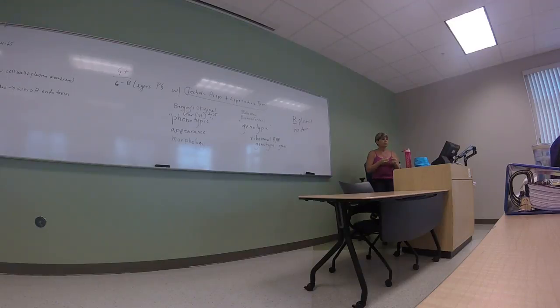Differential agar means when a certain type is present, you'll recognize it by a color change. Let's say I have a medium that's differential for her type and not for her type. First of all, I might select so she gets the advantage, but when she grows on the Petri plate, I'm going to see that bright, colorful shirt. I know she's there. I know she made it. I know she grew. I don't see anything about her. She didn't change the color of the agar, but she did. When she showed up in those bright colored shirts, I'm like, wow, she really is there. So that's differential. You're going to look for a color change.